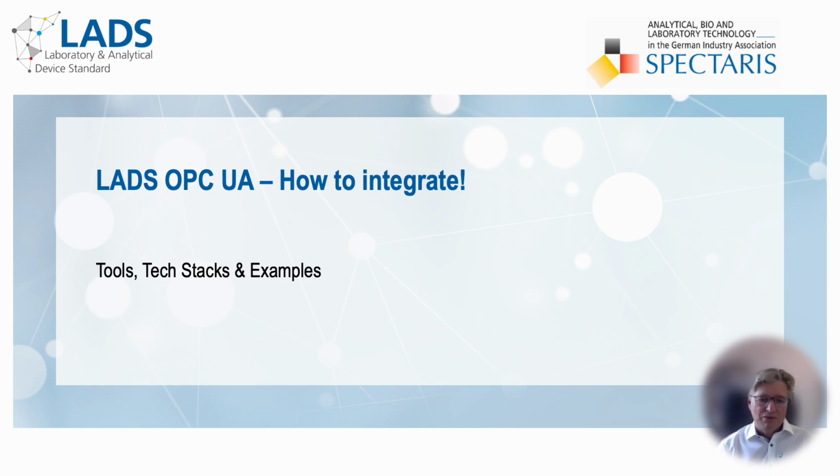I will also provide a valuable reference to a LADS server integration workshop available on GitHub under the MIT license. This workshop example can be a helpful resource for those interested in implementing LADS OPC UA in their projects. Additionally, I'll share an overview of popular tools and tech stacks used in the process.